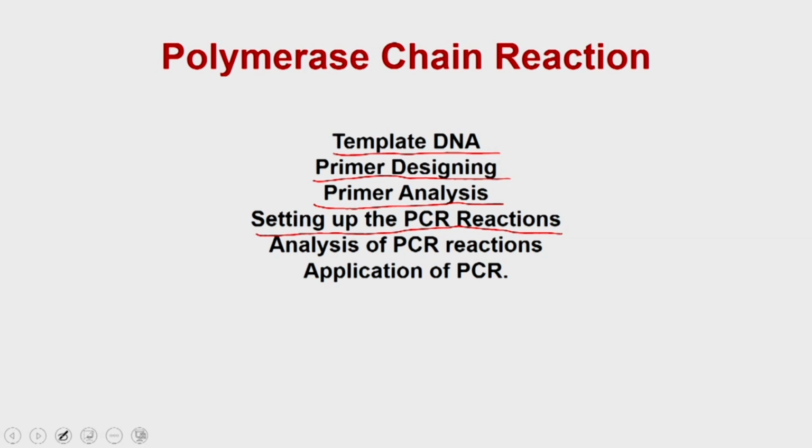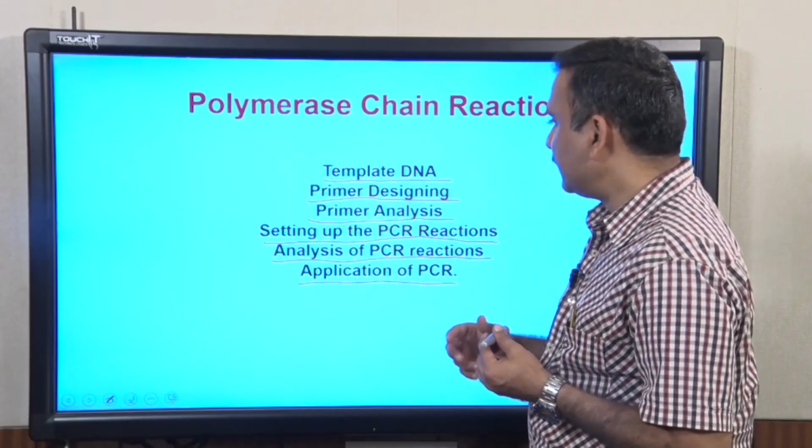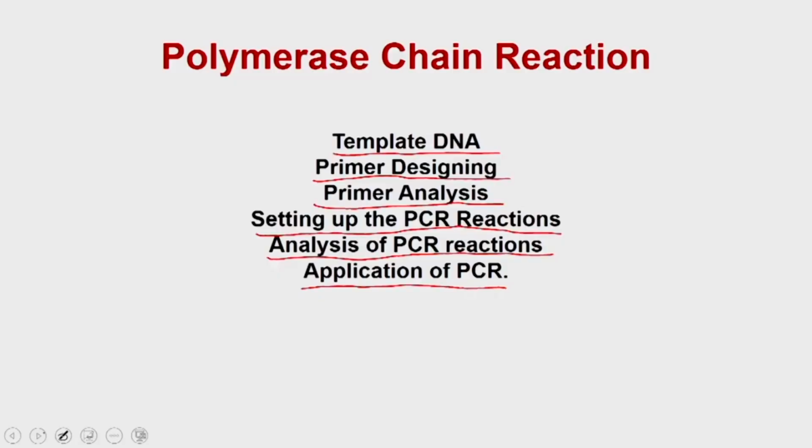Once the PCR reactions are over, we will take out the reaction products and analyze them on agarose gels. At the end of this lecture we will also discuss the potential of PCR in biomedical research and biotechnology research. So, let us continue with the template DNA.